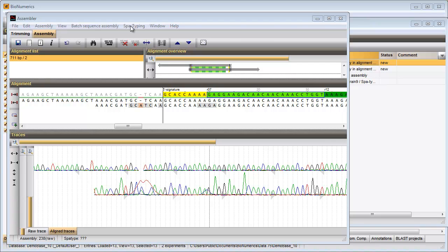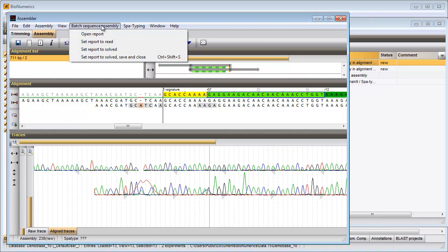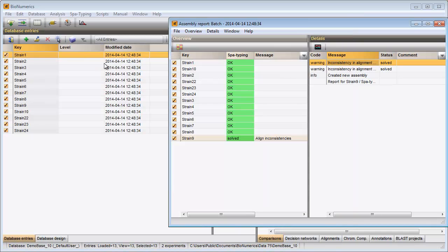I save the changes and close the assembler window. The cell is updated and is displayed in green.